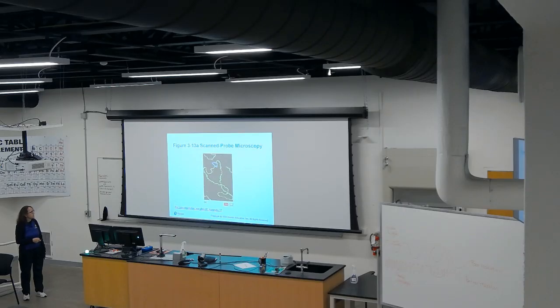So in here we have scan probe microscopy showing you the strands of DNA. And you can even study if you have any mutations in the DNA there.